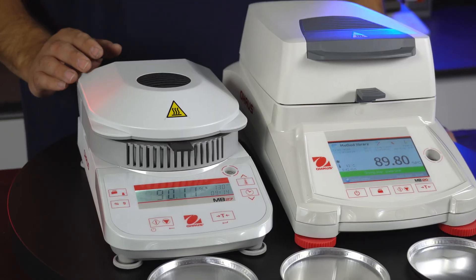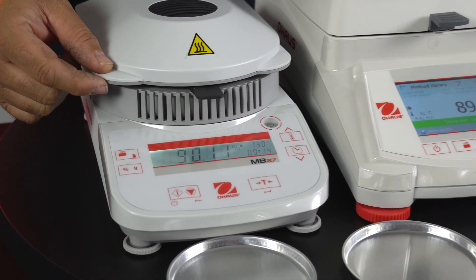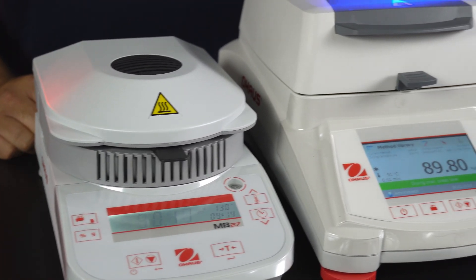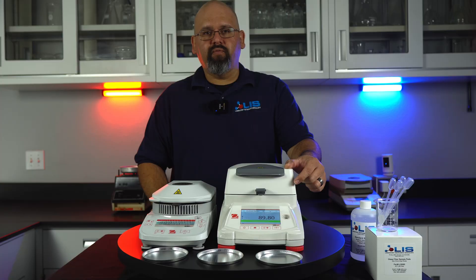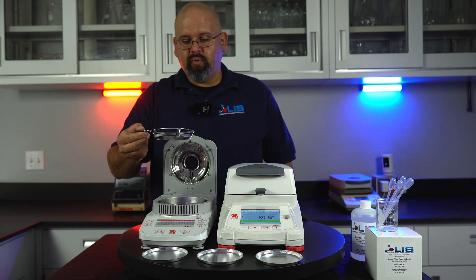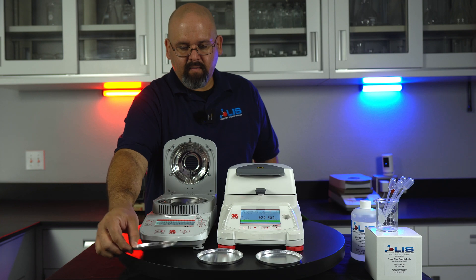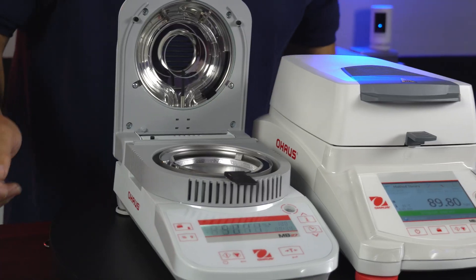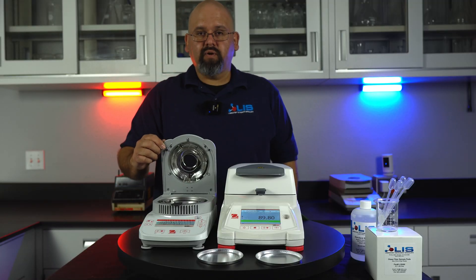Now that the test is complete, the MB-27 will give you a continuous beep until you remove the sample or press the tear button. The MB-120 will beep once and record the test result into its library and hold it there for future reference. When the test is complete, open the lid, use the sample holder, and throw away your sample. You can then prep for the next sample by applying a new aluminum dish, then press the tear button to zero out the dish and allow you to start the next test.